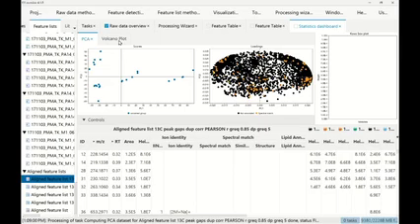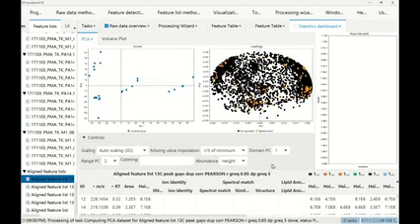But then we can really make it very interactive. So here we can see, for example, the PCA. We can see the different samples, and we can see the loadings of the features and the table. And just on the controls down here, I can, for example, set the coloring to the condition. And the condition I loaded from the metadata.